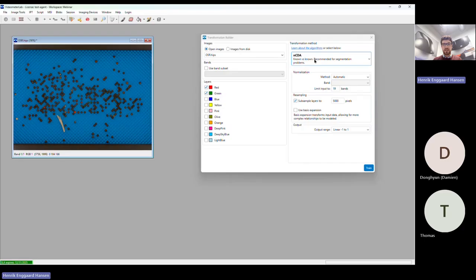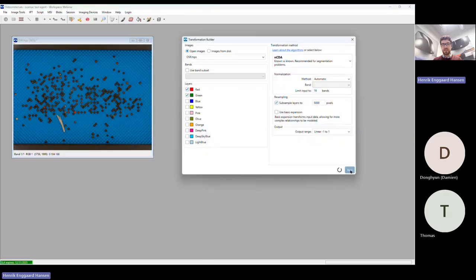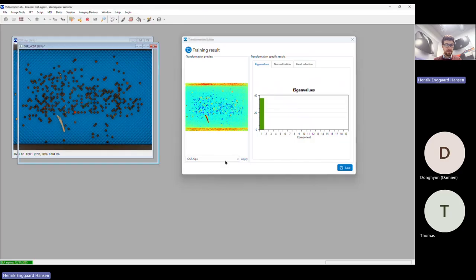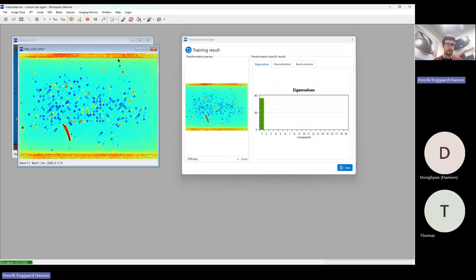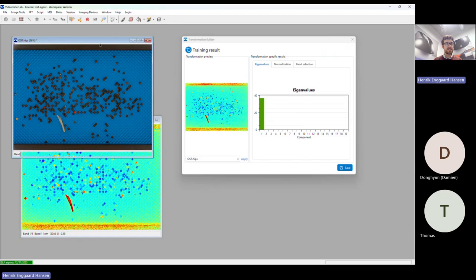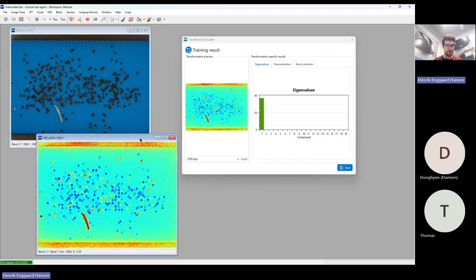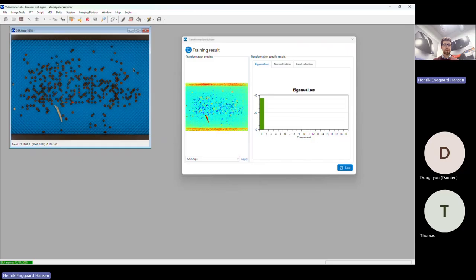So of course this was a very slight difference in the pixels. And when we run it now, we get a picture where it separates the very dark OSR seeds from the very reddish ones. Now, this is actually a little annoying because it's difficult to really see what's going on. So I'm going to show you a little trick.